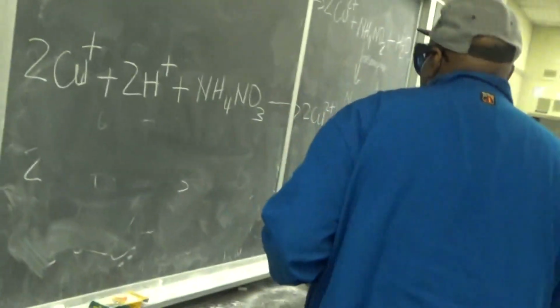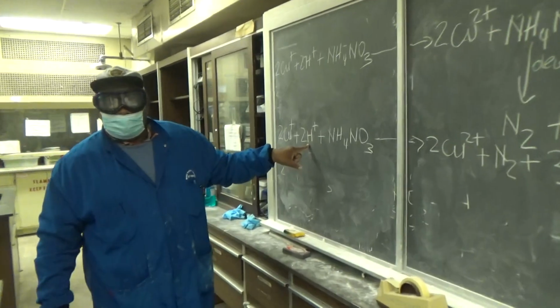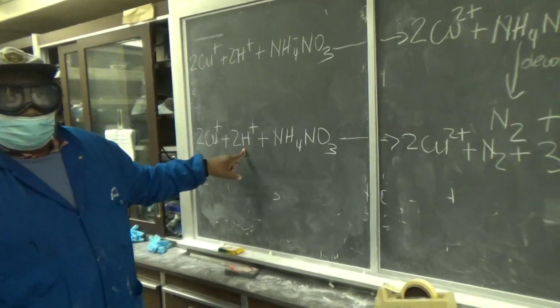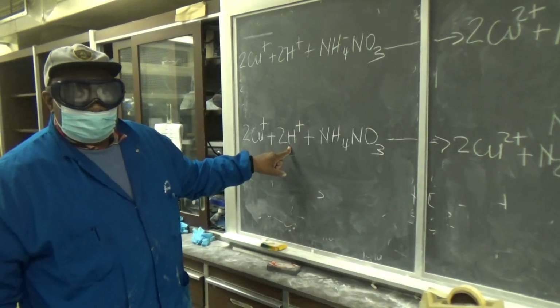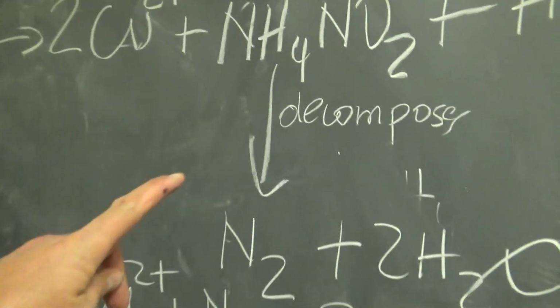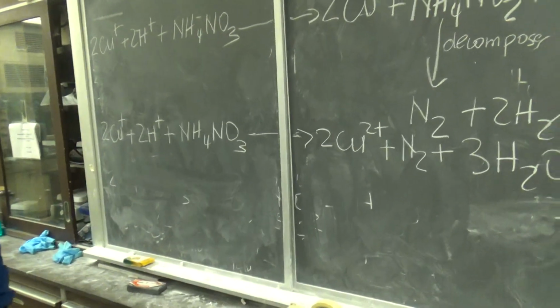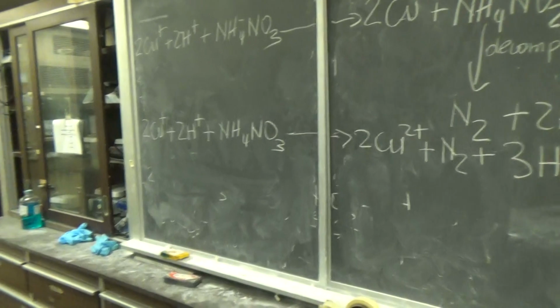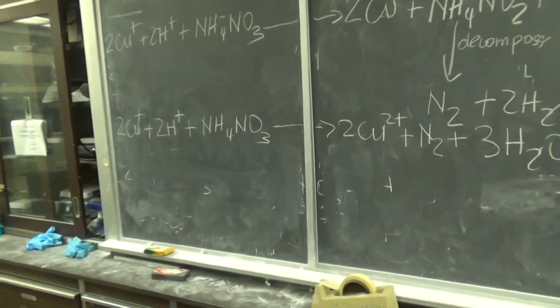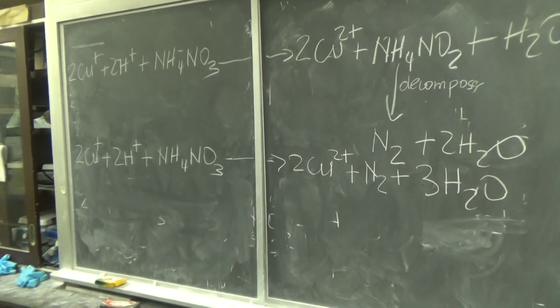So now, what does decompose that? That's the acetic acid. You have the acidic medium here. So the decomposition is mediated by the acetic acid. That's in this step, the decomposition step. It's caused by acetic acid. Without the acetic acid, it would not decompose. But overall, that's a pretty cool balanced equation that shows what's going on.